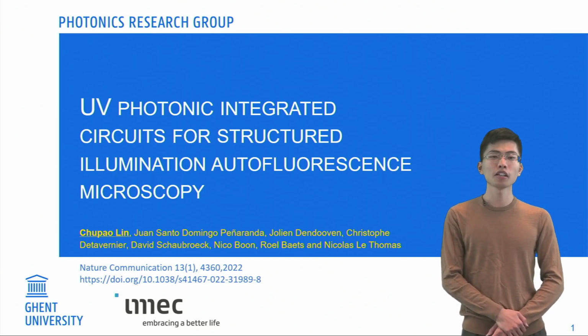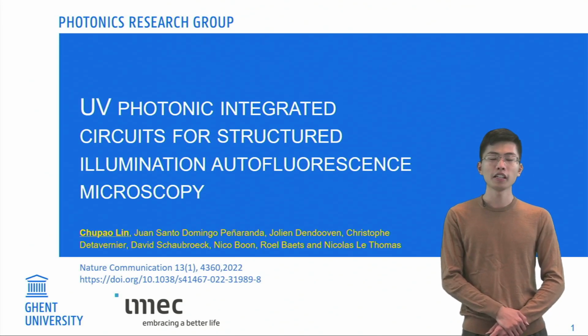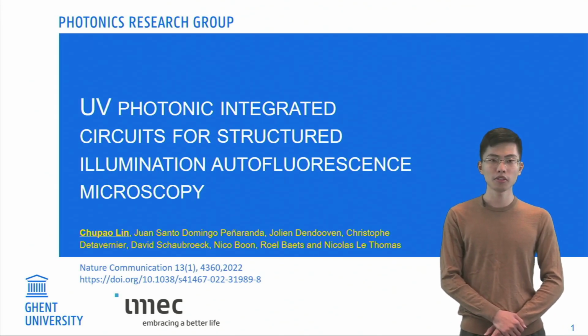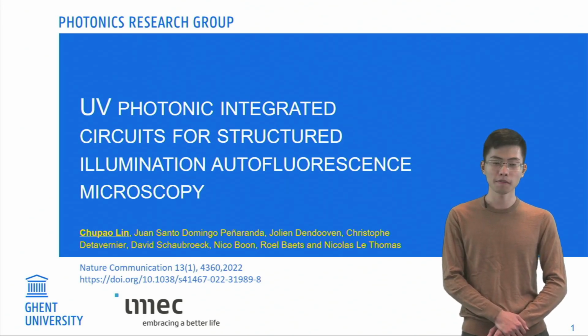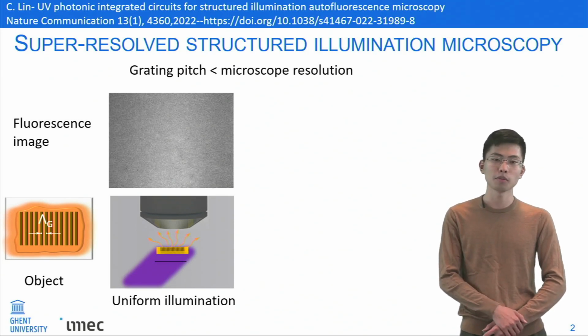In this video, I'm going to introduce our recently published paper in Nature Communications, entitled UV Photonic Integrated Circuits for Structured Illumination Autofluorescence Microscopy. Firstly, let's see how structured illumination can enhance the resolution of a microscope.